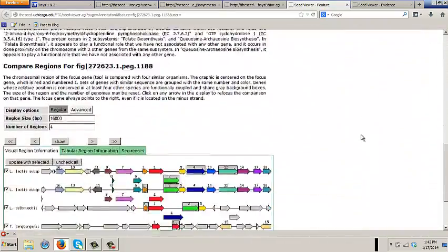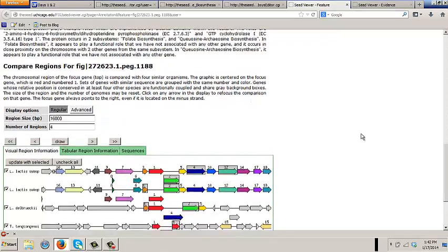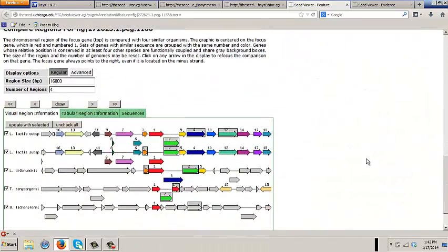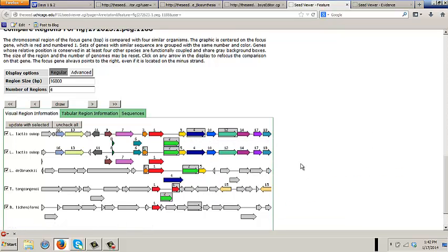That's why we couldn't just call it protein similarities. We had to keep this naming very vague and open to RNAs, proteins, and regulators. For now, it's mostly collections of domain and sequence-derived information about this particular protein encoding gene. A feature is a feature, so it's either a protein encoding gene, or it's RNA, or it's a regulator. For example, here you would see proteins are arrows, RNA is just little rectangular boxes, and regulators are little squares, but they occur much more rarely than proteins, of course.